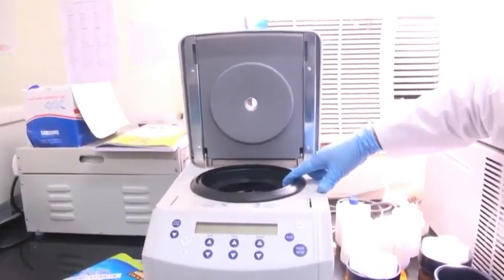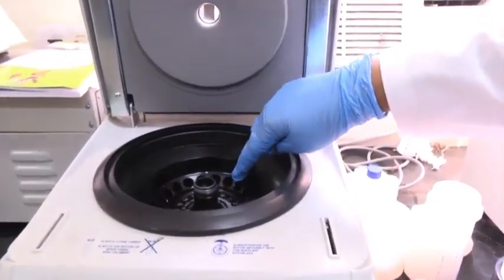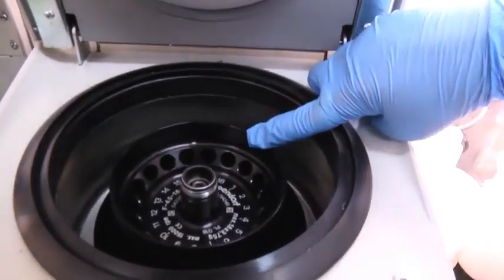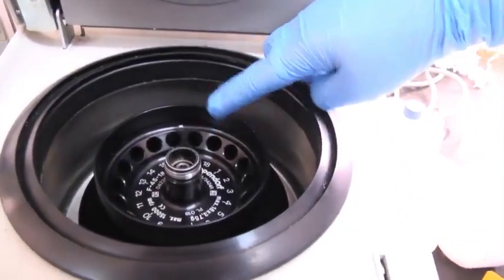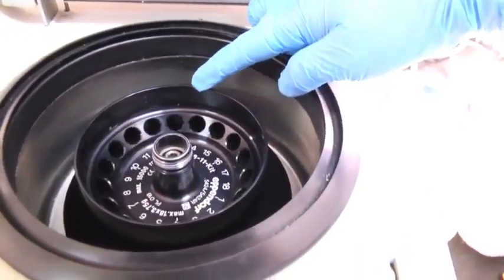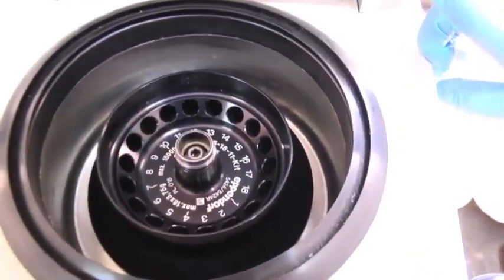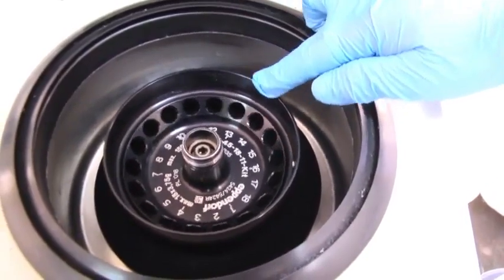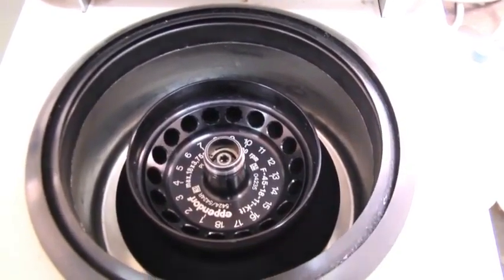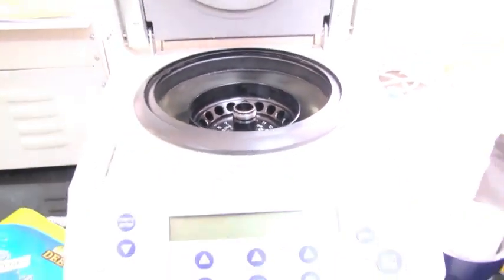But here what you can see in this centrifuge is it has a fixed angle rotor. As you can see these small holes, inside these holes we can place small Eppendorf tubes, and right now the machine is switched off. But once I put the centrifuge tubes here, the machine rotates, and the tube which has been placed here will always remain at a constant angle. So that is why this is called a fixed angle rotor. This centrifuge works in a similar fashion to the earlier centrifuge, and I will be showing you some other centrifuges subsequently.